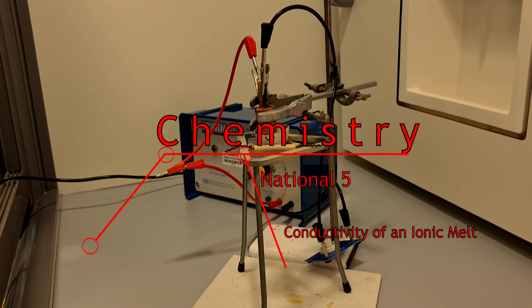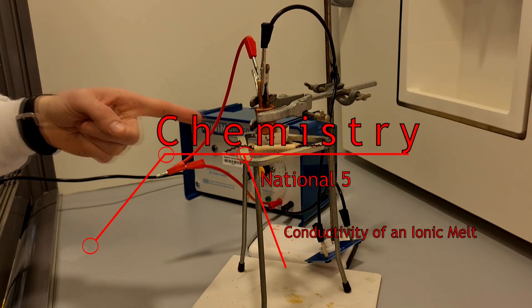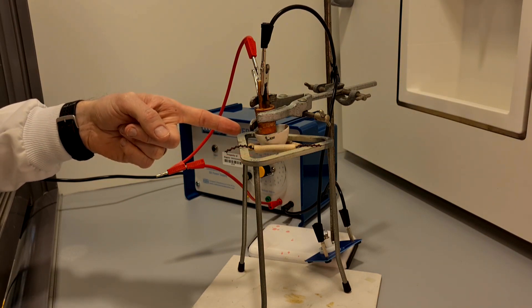So in this experiment we're going to test the conductivity of an ionic melt. In this crucible here we have some zinc chloride powder.